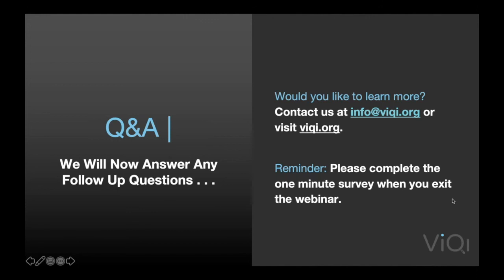Well, we have another question from Jacob, who says, what are good pieces of software to use for developing neural network and feature-based AI? So I believe I listed some options for feature-based AIs. A big tool that I think everybody in the field uses nowadays is called sklearn. I don't think I put that up there. So that's Python. First of all, this is in Python.